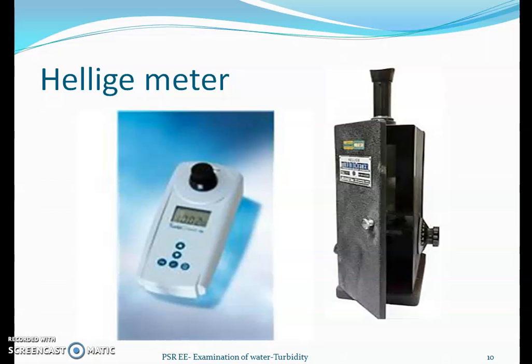We have to control the light intensity so that the spot and the surrounding field are balanced, with the help of this right knob. The brightness of the light is controlled from the left hand side, and the light is balanced at different levels by rotating from the lower value to the higher value, and the black spot at the center is going to disappear. Just where it disappears, we stop. Then we view from here, and the measurement shown gives the turbidity of that particular sample.